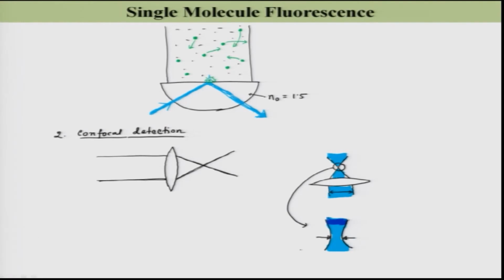is your diameter, right. But if you do the same thing, same lens if you take, and in this case let us say incoming beam of the same color, the diameter of the incoming beam is much more than this, obviously it will again focus, focal length is similar, so it will focus in the similar position, right, like this way.